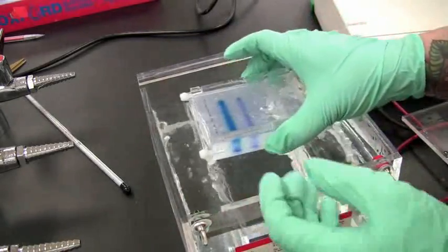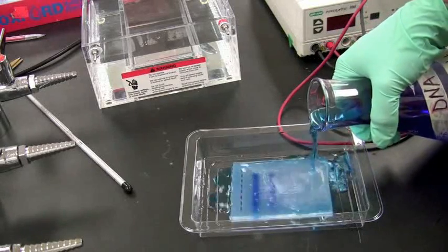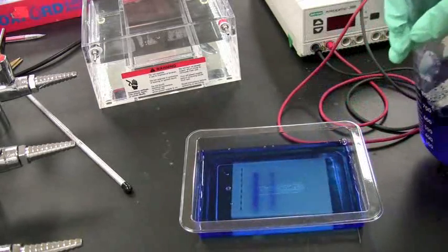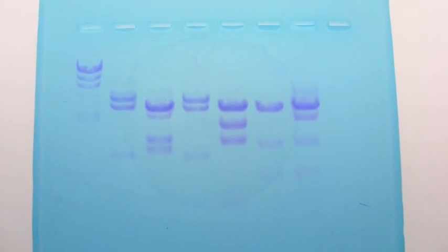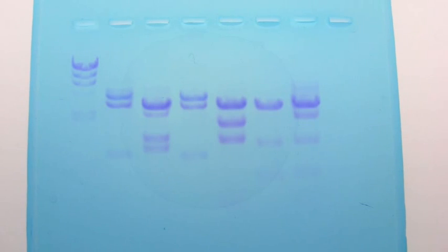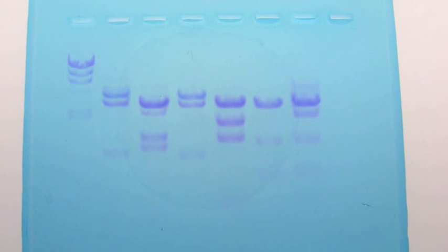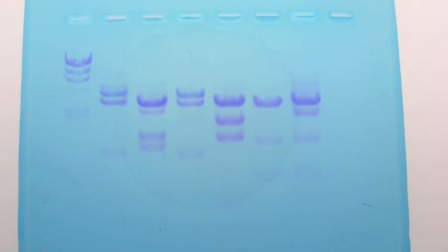The first lane in the gel is the ladder, which breaks down at known fragment sizes and is used for quantification. Lane 2 contains the criminal DNA, and the five lanes after that contain the suspects' DNA. The digestion will cut the DNA at the recognition sites, and for each DNA the pattern will be different — except for the suspect whose DNA was at the crime scene. Those two will cut at the exact same spots, have the same number of fragments, and will appear the same on the gel.